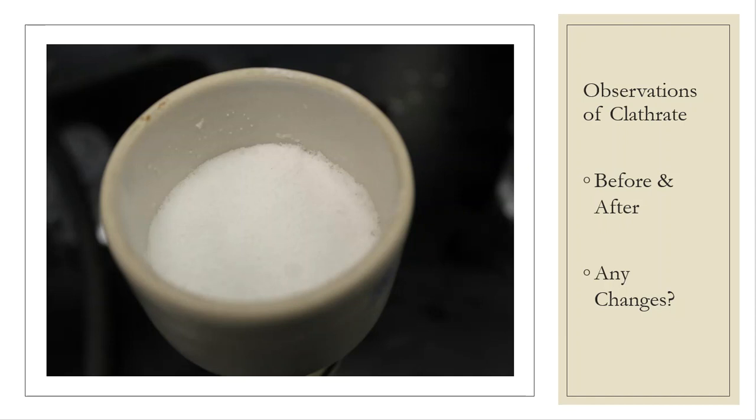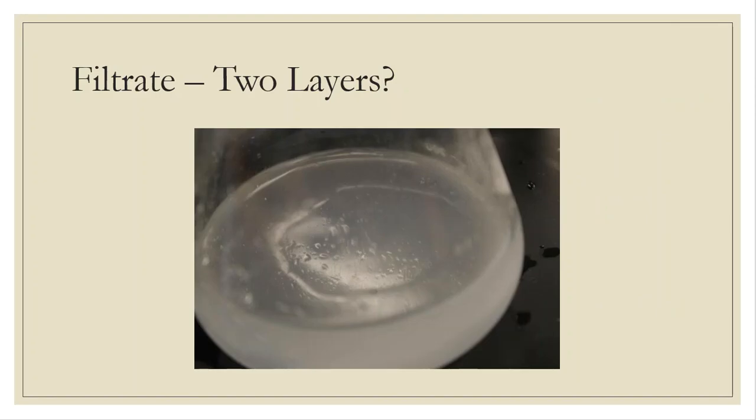I let it run, just pull air through it, kind of help dry out that clathrate a little bit, and within that 30 minutes, I went back, turned the funnel off, and then I took another look at the filtrate that was in the filter flask down below, and this is what I saw.